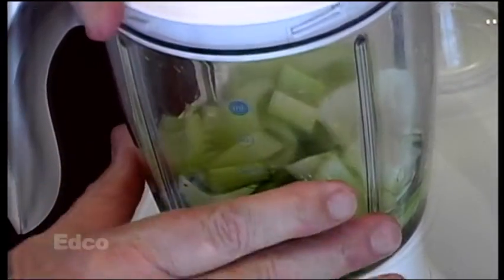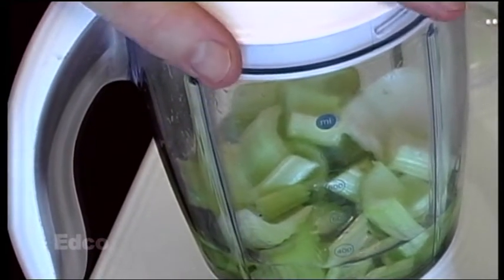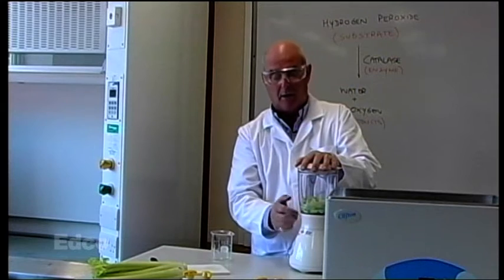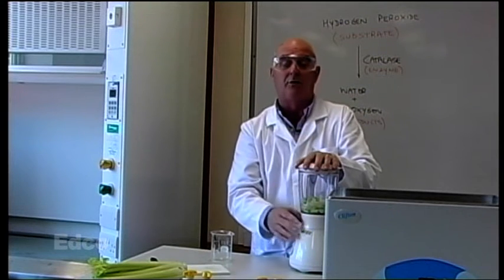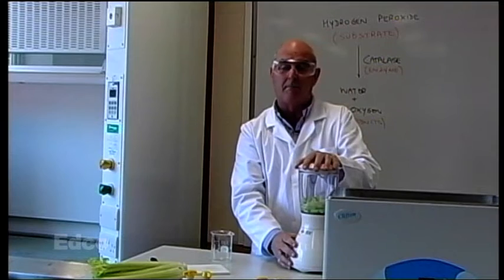and we can only blend for a maximum of 6 seconds. So we'll blend for about 4 seconds. If you blend too long, the enzyme gets chopped up and gets destroyed, becomes denatured in that respect. So we'll blend for 4 seconds.